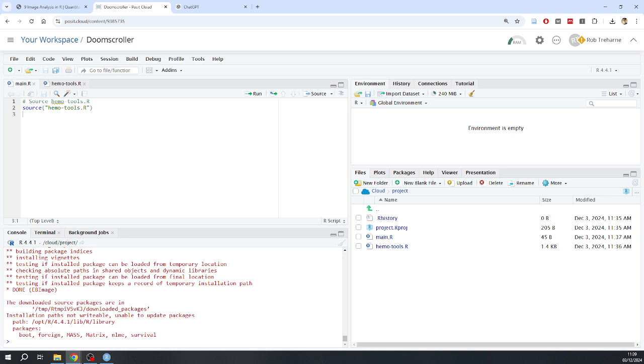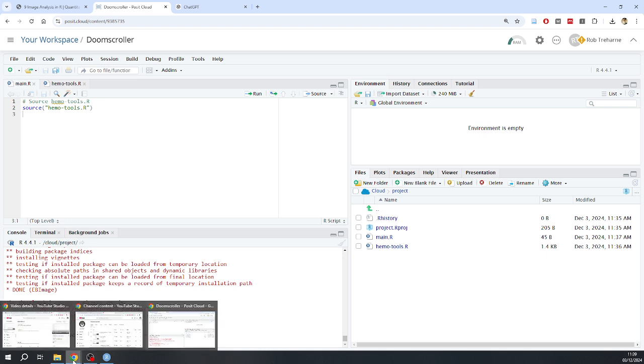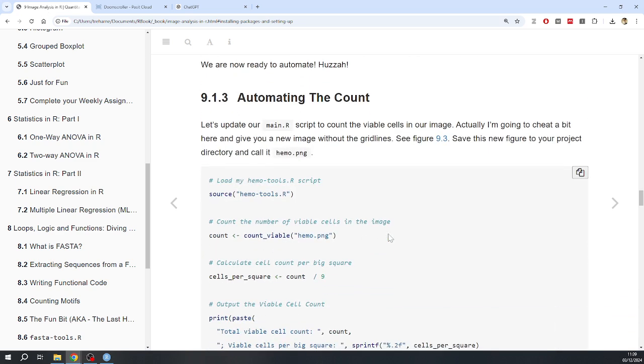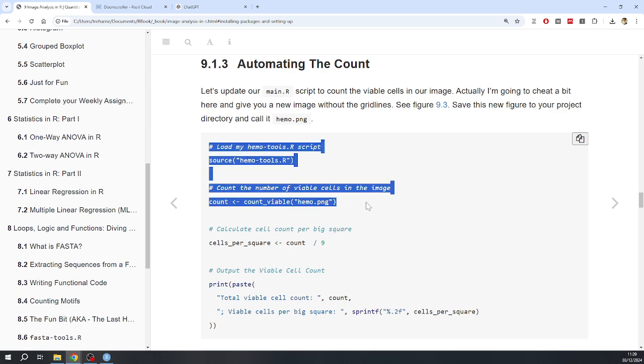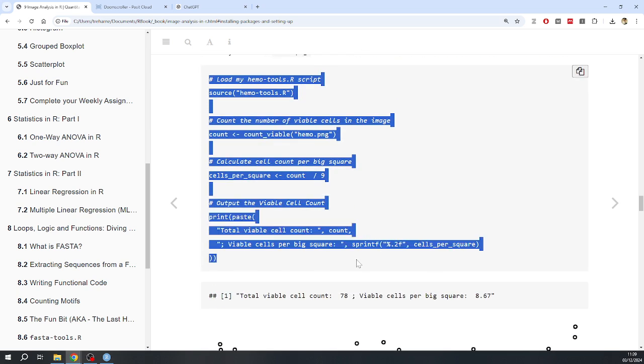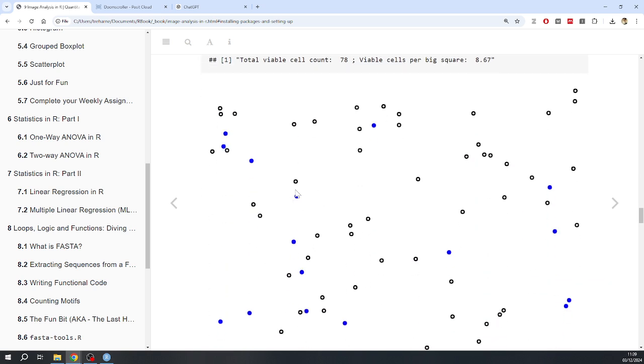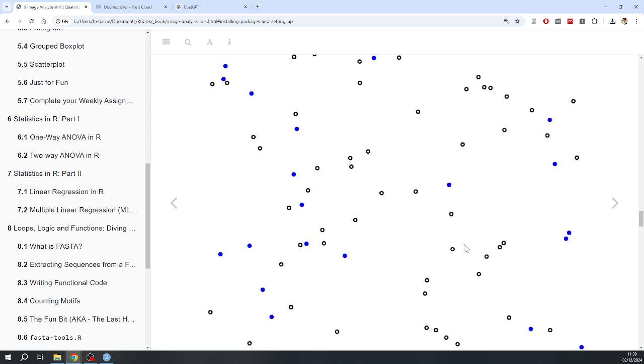I have got to do a few things here. First, I'm going to get my data. Okay, so I'm going to skip over this bit. You'll be able to watch this in the video just for this single file. And what you'll have to do here, in fact, I am going to do this.